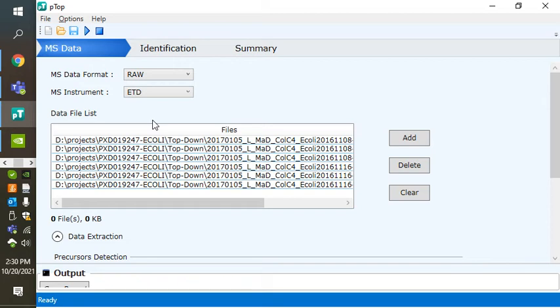software options. Secondly, it's Windows-oriented, which means that you don't have to learn how to use the command line or, heaven help you, Linux in order to make use of it. It's also very fast and pretty darn sensitive too. So I feel like it offers quite a lot to make your day easier if you are working in top-down informatics.